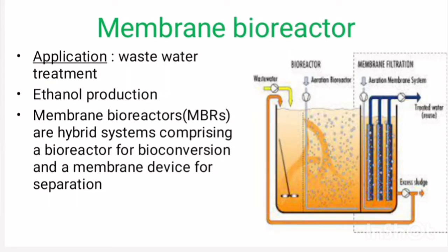Next one, membrane bioreactor. This is mainly used for wastewater treatment procedures, and it is a new approach to the fermentation technology. One example for this is ethanol production. Membrane bioreactors are hybrid systems comprising a bioreactor for bioconversion and a membrane device for the separation.